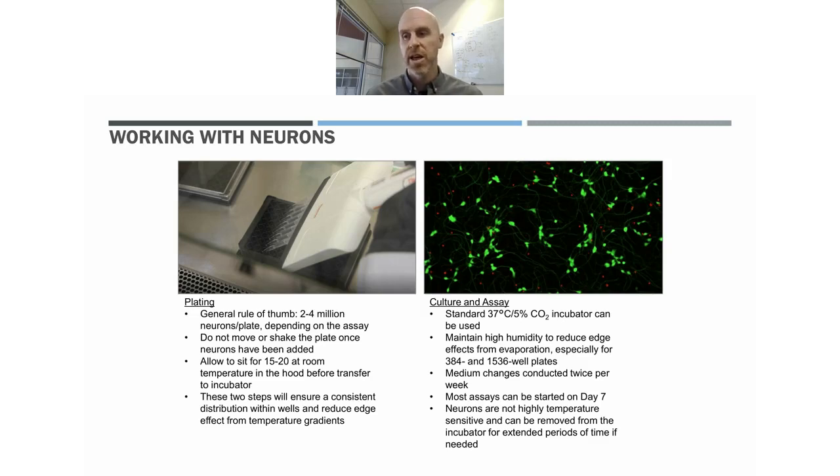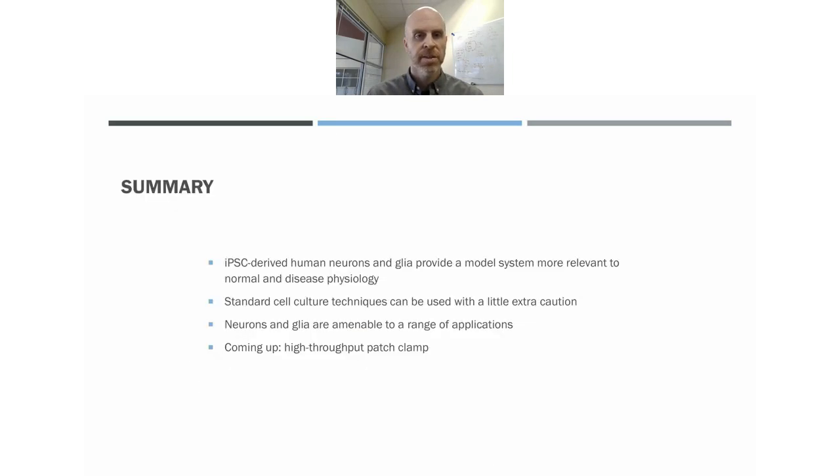The cultures tend to get a little bit more difficult to work with over time, in terms of the neurite network growing on top of each other as time progresses, but you can take them out for that long.